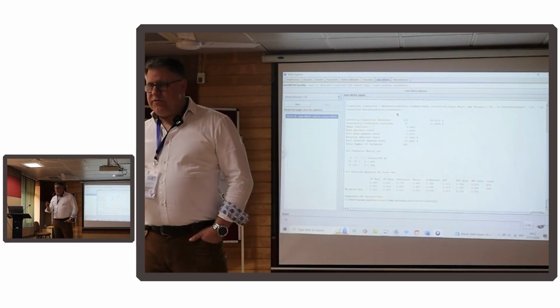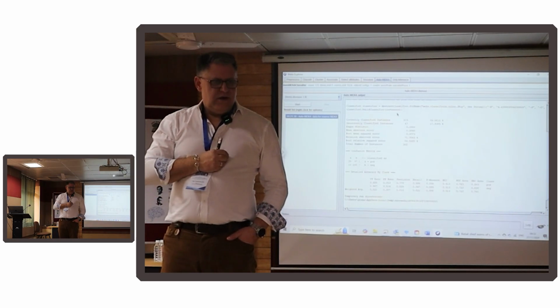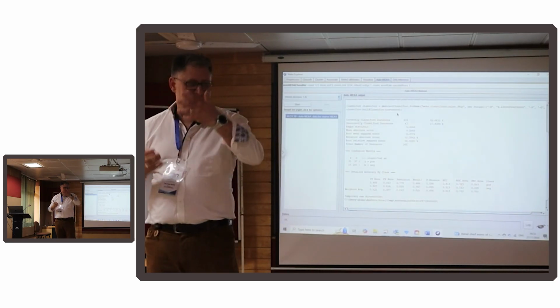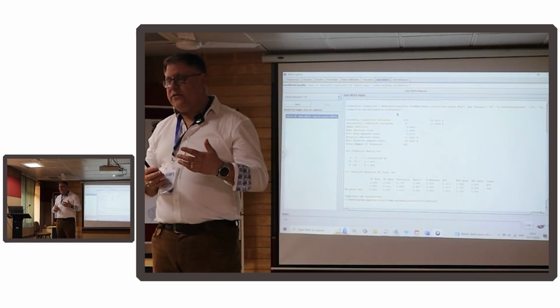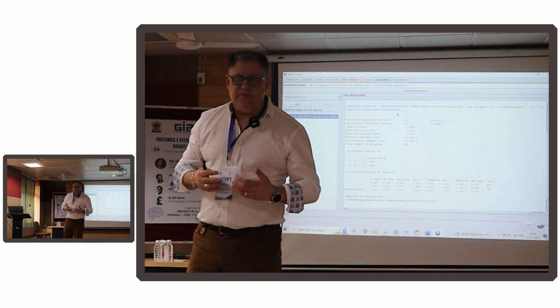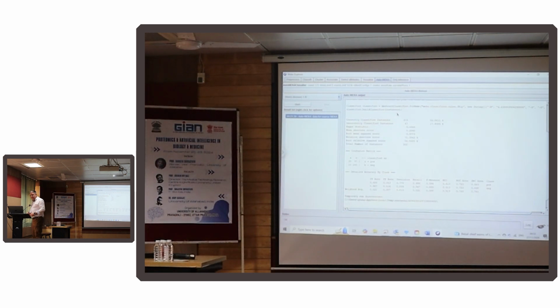I've had people come to me to analyze data where they've got 99 of group 1 and 1 of group 2, and I just say you're not going to get anywhere with that, because you need a good representation across both of the classes for the algorithm to work well. So that's an important consideration, balancing the numbers. And this is not a balanced study. If you're working on continuous values, you don't have to worry about balancing them because you have a continuous range. That's okay.